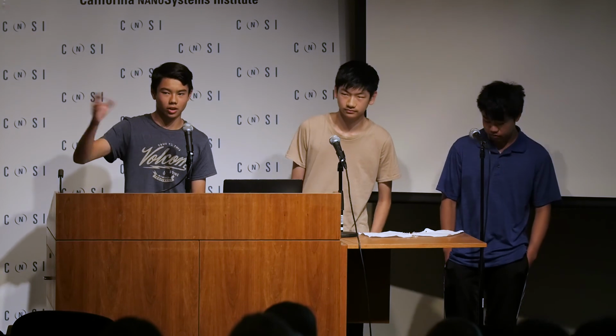So here, let me help you guys out. You learned from plasmonics that if you're observing a color change, the particle might be getting bigger, or might have more arms, more surface area. So what were you using to determine that when you were synthesizing your silver nanoparticles? We were using light, the color, to determine. So when it turned more yellow, that's when we took it out.